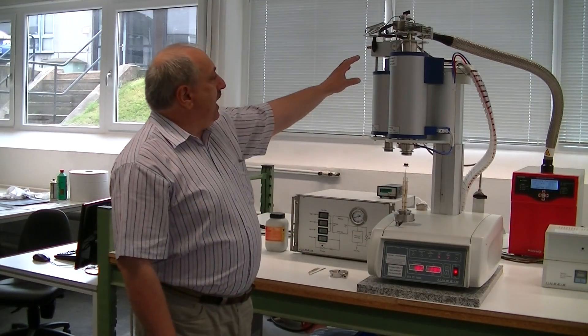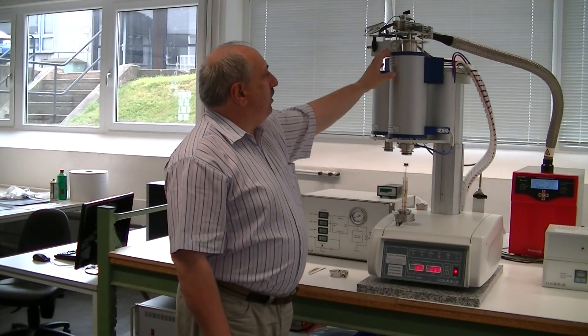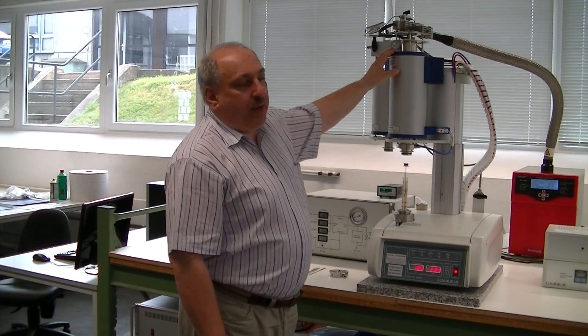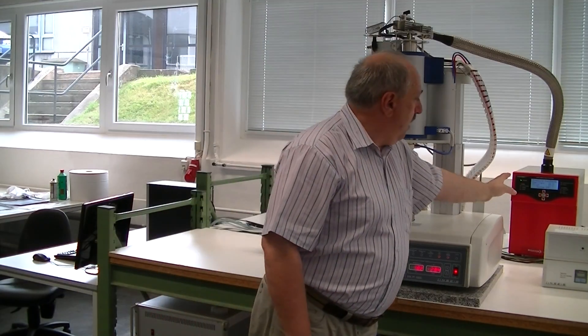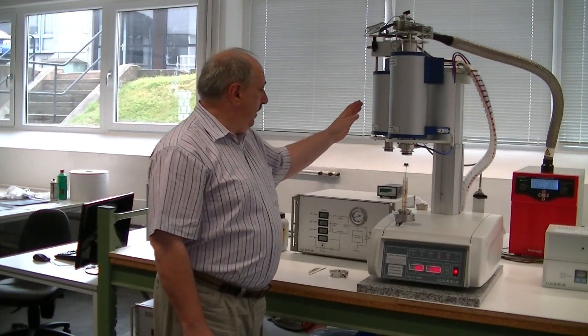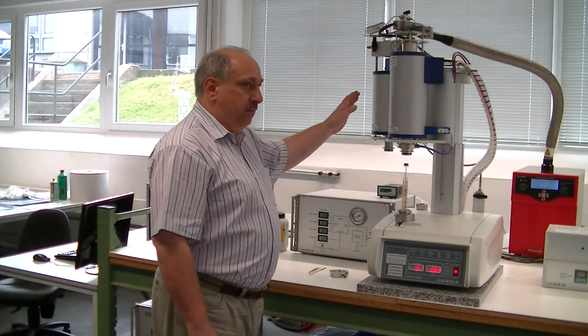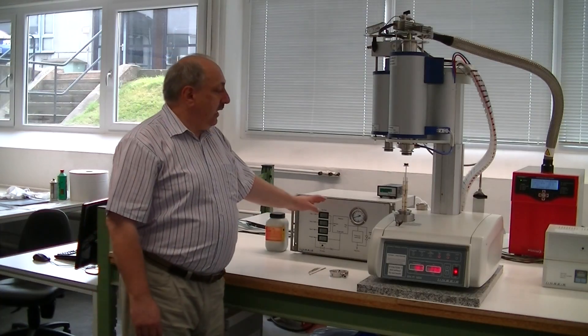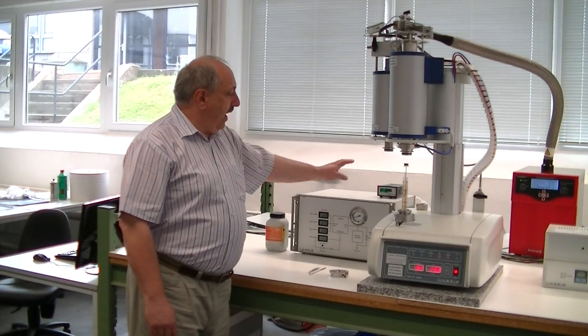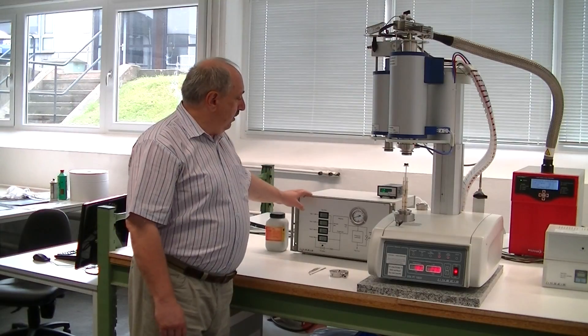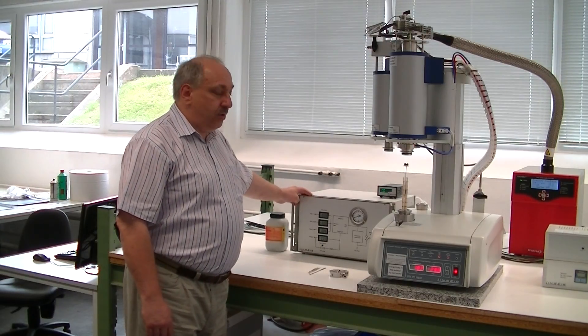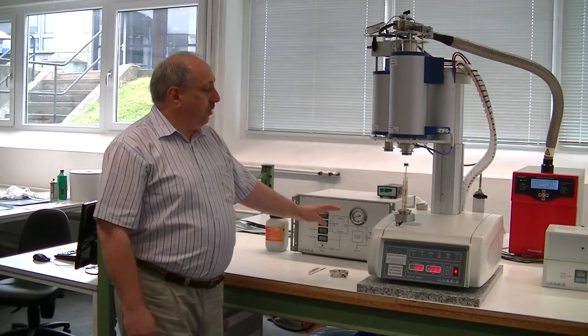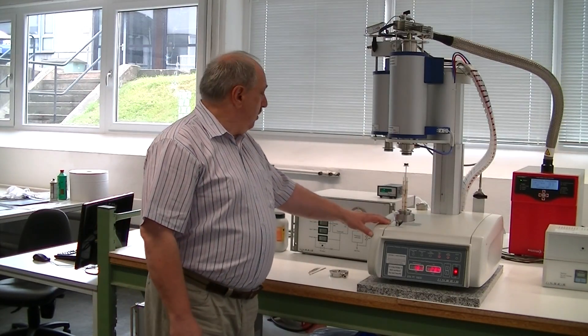In addition to the pressure inside, you can connect a mass spectrometer like you see here on the back or you can connect an FTIR infrared spectrometer. Then for operation in gas and vacuum, we have a vacuum pump which is behind the table. And on the left side of the thermal balance, we have a gas control system to control the atmosphere inside the machine.